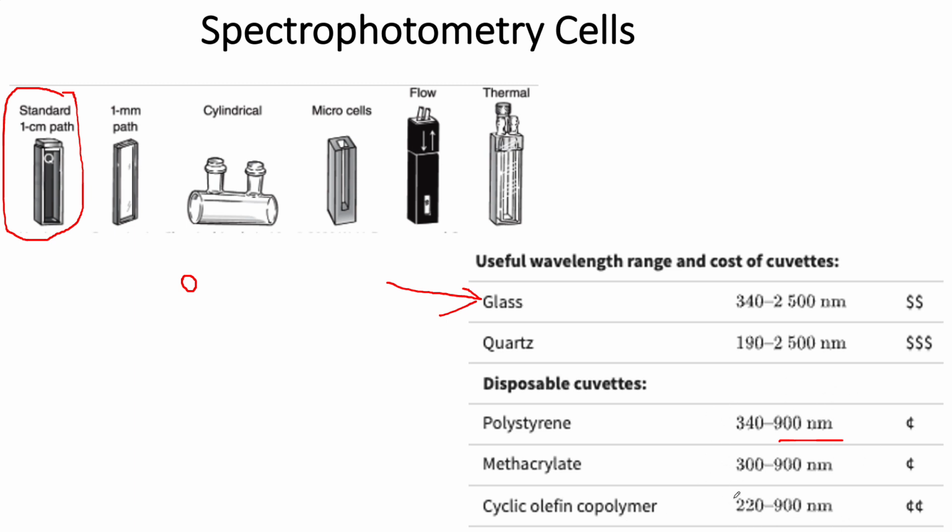And they tend to use a lot of these in biological systems, hospitals, and medical settings, because they don't want to have to clean these things out. You don't want to expose people very much. So it's much better to just throw things away. And a lot of that gets done in hospital kinds of settings.